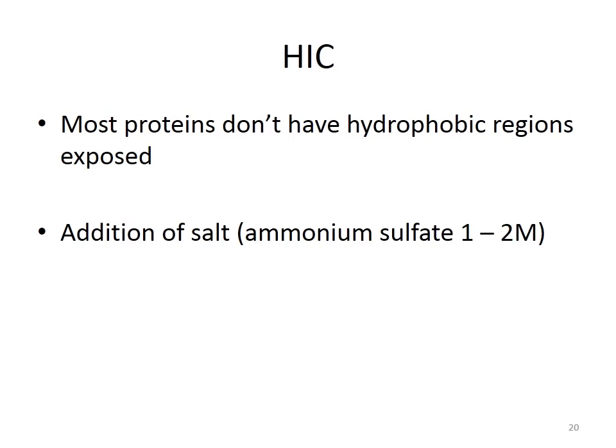So in order to separate proteins on the basis of their hydrophobic regions, it won't be possible if the protein is folded in its original structure. Because when the proteins are folded, most of their hydrophobic amino acids are buried in the core of the protein, and the hydrophilic amino acids are present on the surface of the protein.